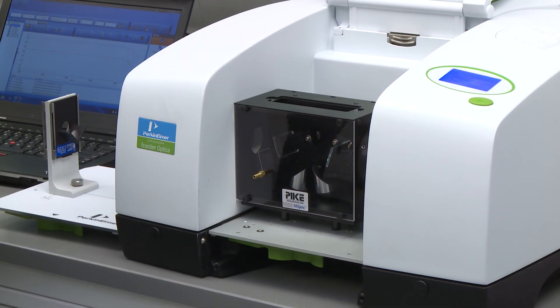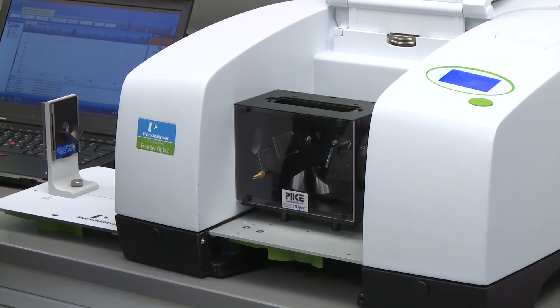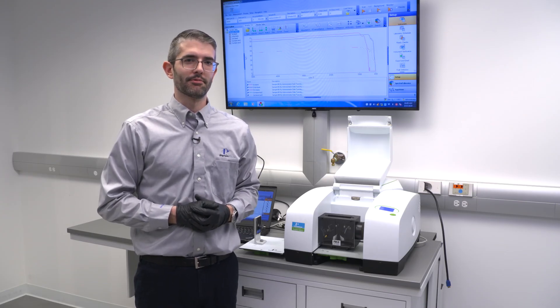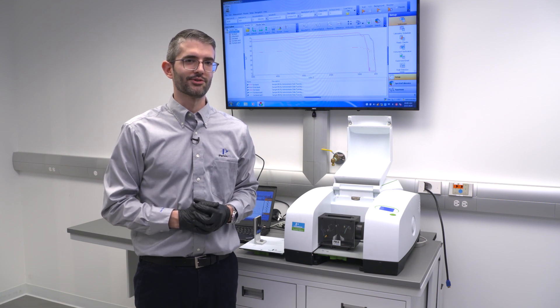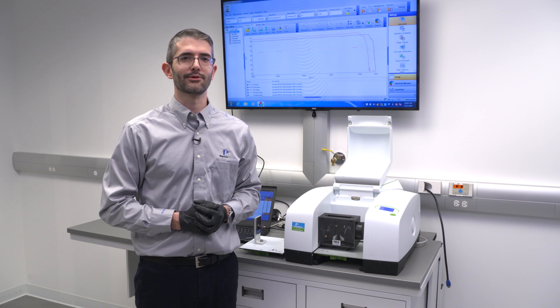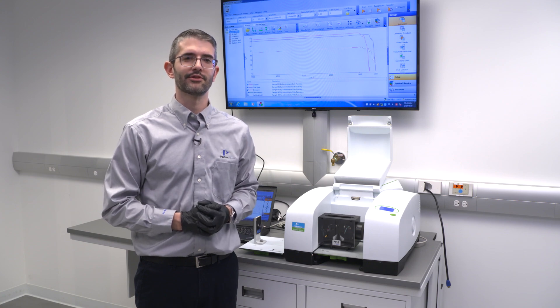The system is now set up for specular reflectance measurements of samples. Thank you for joining us today for this presentation of the capabilities and technology of Perkin-Elmer's Frontier Optica. For more information, please contact your local sales representative. Thank you for your time.